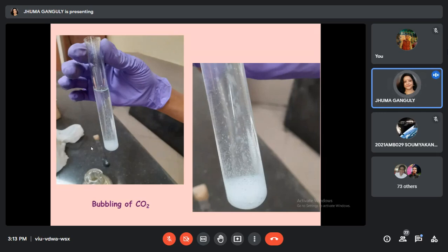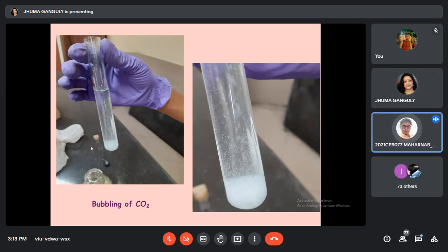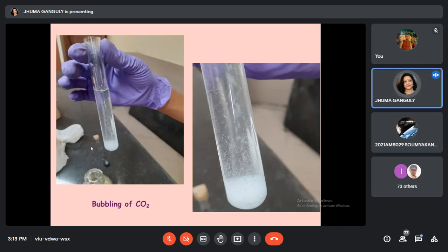So now my question: can you get any smell from this carbon dioxide? No, ma'am, carbon dioxide has no smell. But if there is some ammonia, you can smell it. Here you will not get a pungent smell, so it is only observation. Ammonia smells very bad. Yes, pungent. We have one experiment later on where ammonia evolves, and the whole room smells like ammonia.